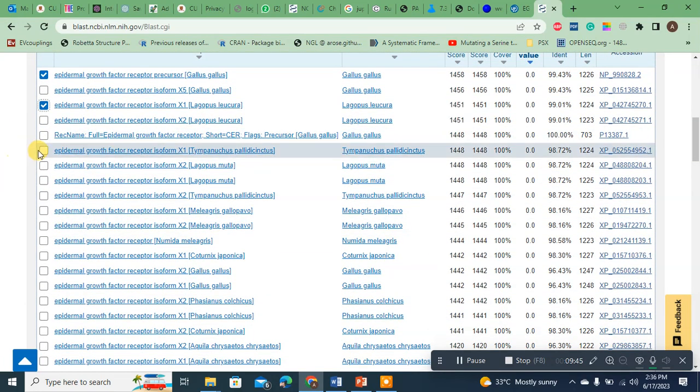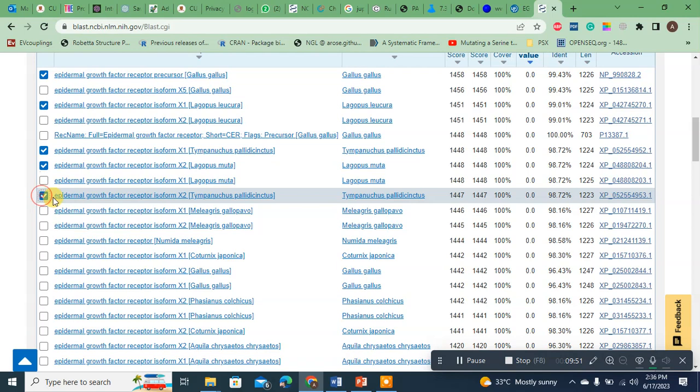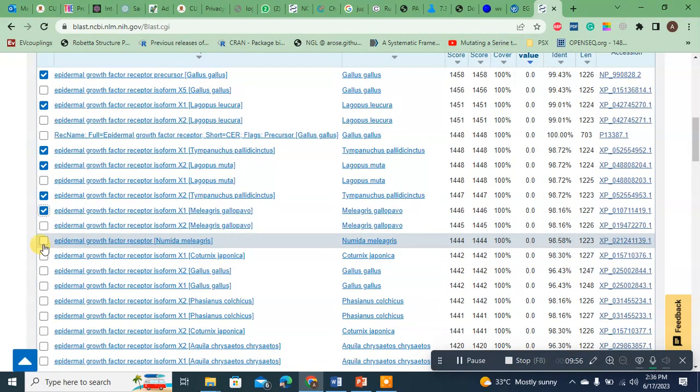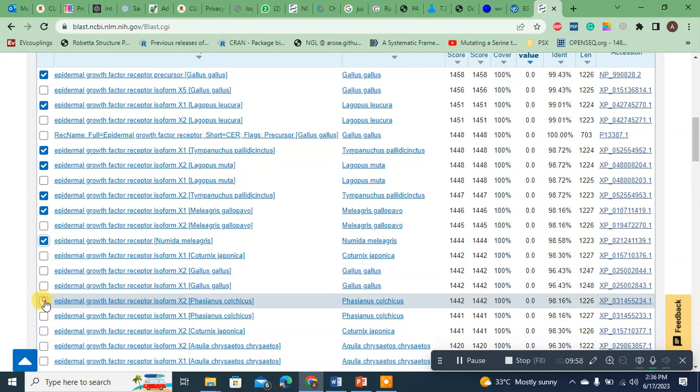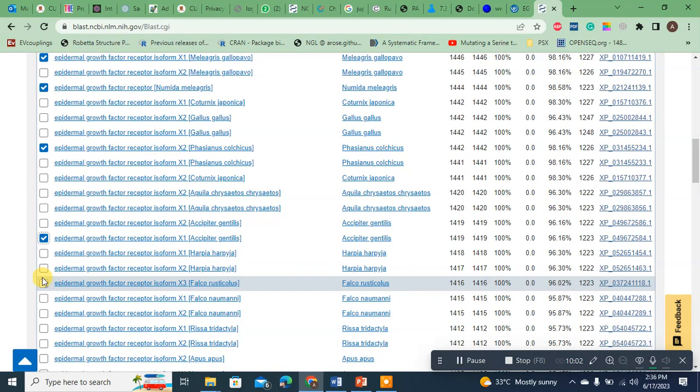Now select this one, select 1 from these two, select this one, select 1 from these two. Okay, select this one, select this. So I'm going to randomly select a few more.